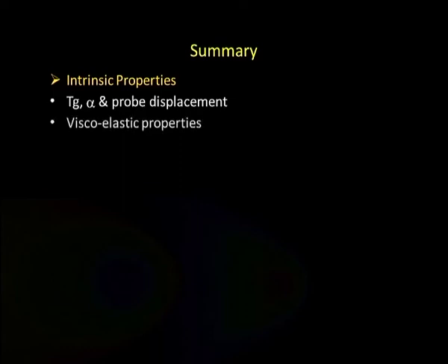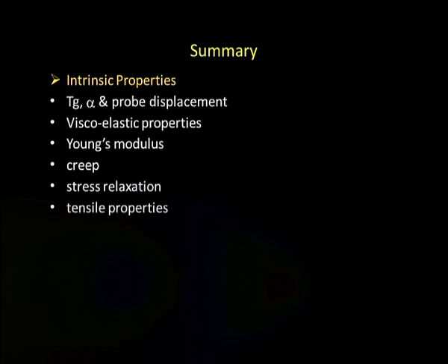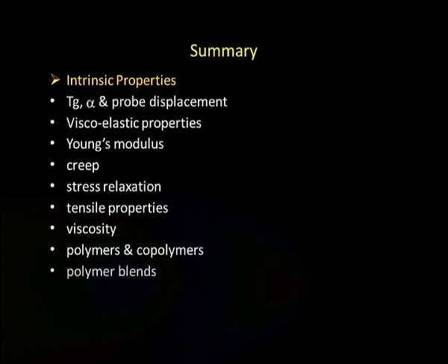To summarize, we have learned today about thermal mechanical analysis, intrinsic properties, Tg, alpha and probe displacement, its viscoelastic properties, Young's modulus, then creep, stress relaxation, tensile properties, viscosity, polymers and copolymers. Then we have learned its application in polymer blends, polymer morphology.